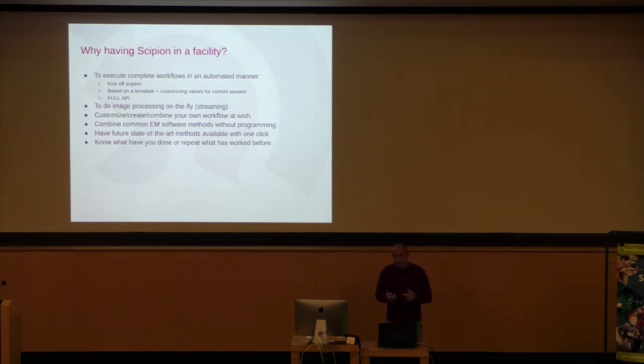Something that is not yet there is a future method that will appear. We don't know where it's going to happen, when it's going to happen, but maybe there's a new method in the future for, I don't know, estimation of some CTF or for tomography, whatever. Through Scipion, you can have it, or if someone makes the effort, usually we do it, but we are encouraging developers to maintain their plugin and wrap their software into Scipion.